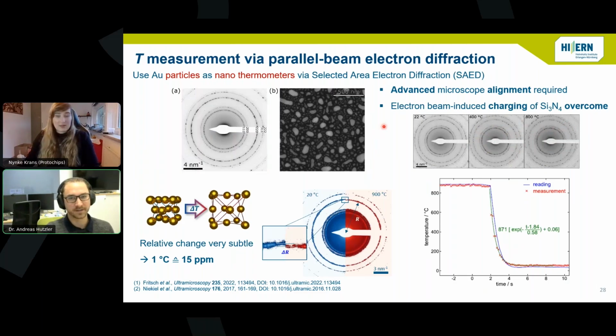But yeah, sure, there might be some different effects, especially in liquid. We did these experiments under vacuum conditions, under gaseous conditions, and under liquid conditions.